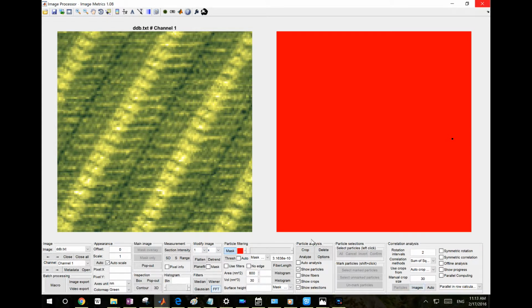Essentially, when you average results, the noise that is not periodical will be decreased, and it will still increase the signal to noise ratio, so you probably don't need to do any FFT to remove unnecessary other signals.